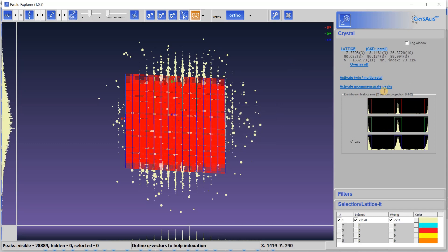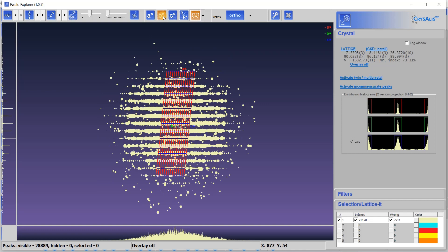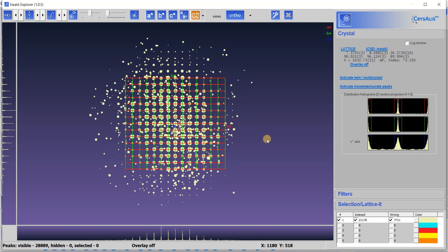Now you can see the histogram has improved, and the new cell parameters are 7, 8, and 26, with angles 90, 96, and approximately 89. Indexation is 73% — not 100%. Looking along the C, B, and A axes, some reflections are not fitting into the cell — they are between the lattice points. These are wrong or unindexed reflections. So go to the List tab and activate Twin/Multi-Crystal.